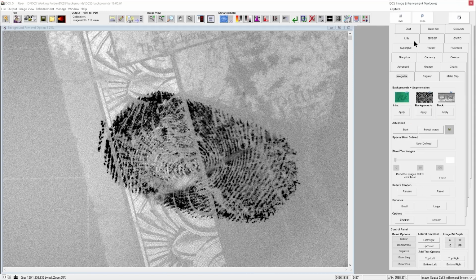Now there is another method of processing that can be used on images like this. Very often images have layers of patterns, and we need to remove things one at a time. Usually beginning with colour, to remove colour information where necessary. Once we've moved to the grayscale image, we can then look at enhancement processes for the black and white parts of the image.